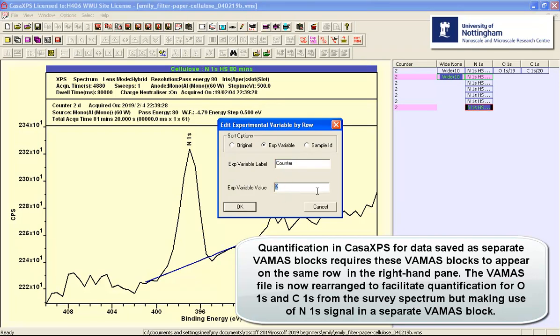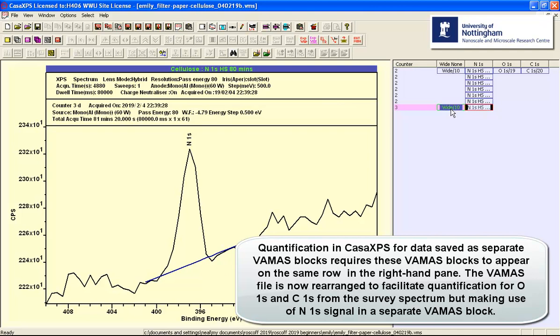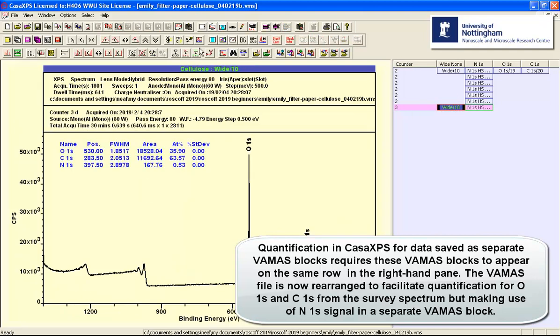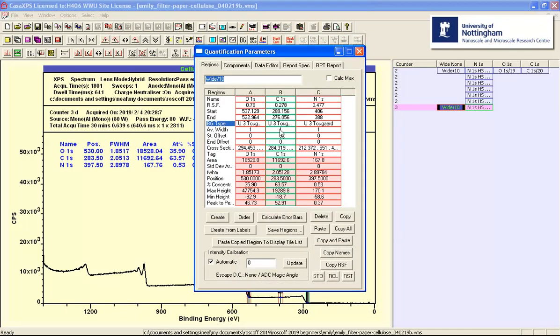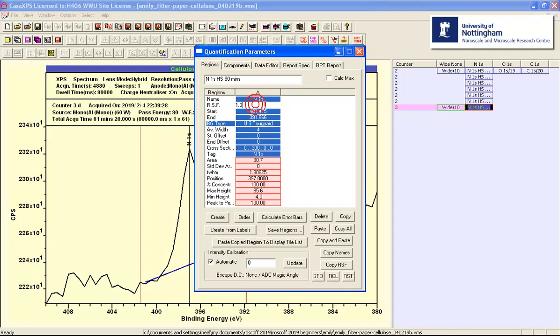And I need to align these. So what I'll do is I'll assign the same experimental variable. So I'm going to, rather than have two, I'm going to set these both as three. So here we have them. They are now both aligned. And I'm going to remove from the survey spectrum that I copied nitrogen.